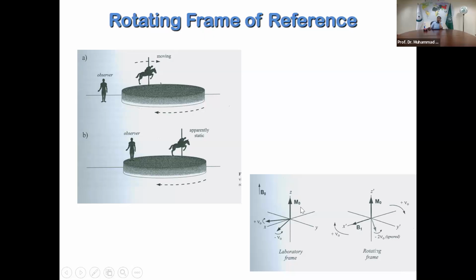But imagine that you jump onto one of the needles, you just come and stand on this vector. The other vector will only be moving with a differential velocity. Imagine there are two fast trains moving at a speed of 300 plus.